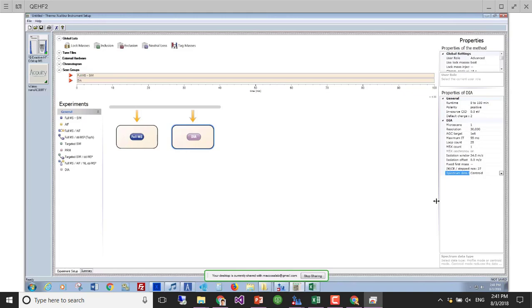However, I find that in practice, those types of files are just really unwieldy to use. Instead of dealing with a 4 GB or a 5 GB DIA file, I would rather just deal with a centroided 1 GB DIA file that's already been peak picked by Thermo in the way that I want it to be peak picked, because they do a much better job of peak picking than you would typically if you were just using a normal piece of software. They know how to deal with their data better than we know how to deal with their data, for example. Does that kind of make sense? So I typically collect this data in centroid, but that's definitely a debatable thing to do.